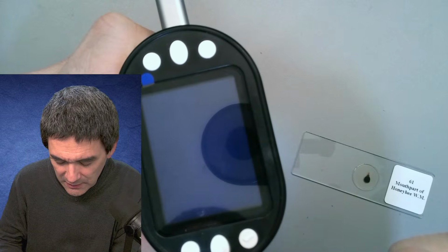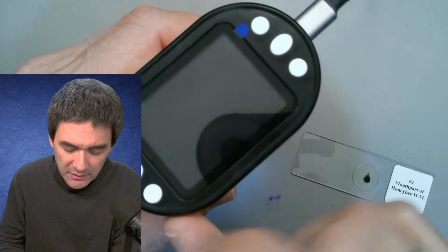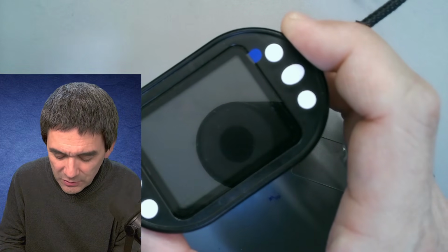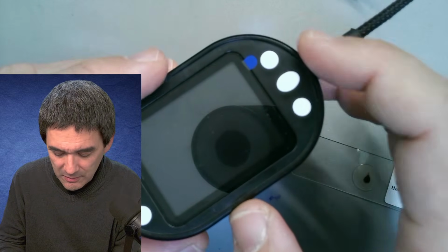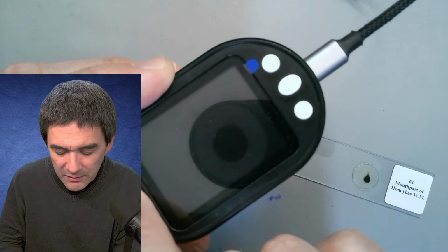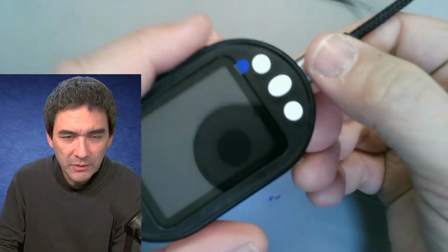So let's have a look. Let's start it on here again. The menu is also not quite the way that I hoped it to be. See? If we see that there's a problem, then this is actually also part of the demonstration, right? Now I cannot turn it on again for whatever reason. I'm going to try to unplug it.